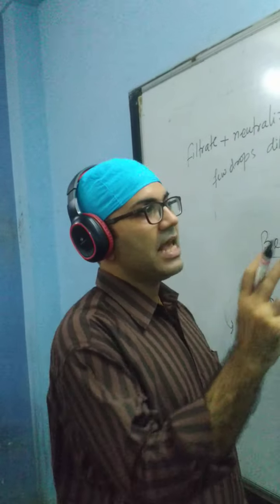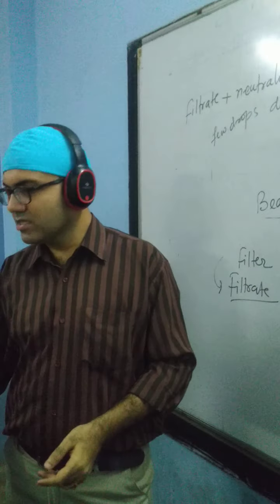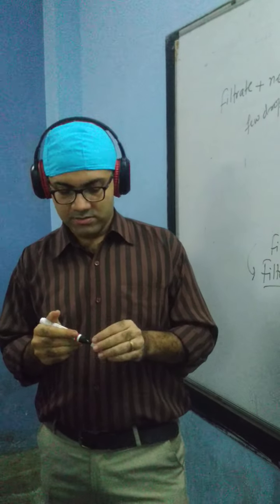Alright, Cl minus confirmed. So let's begin. This is the theoretical explanation.